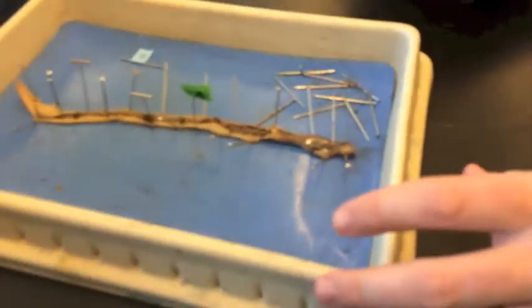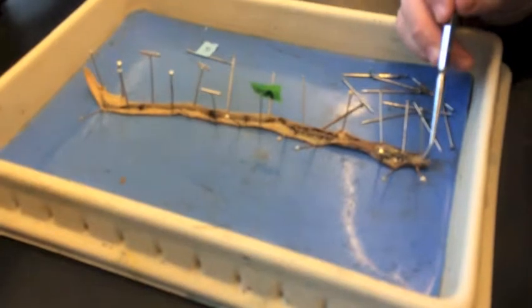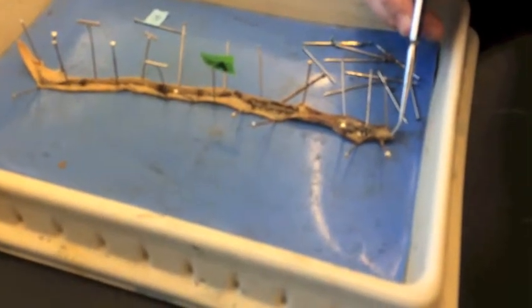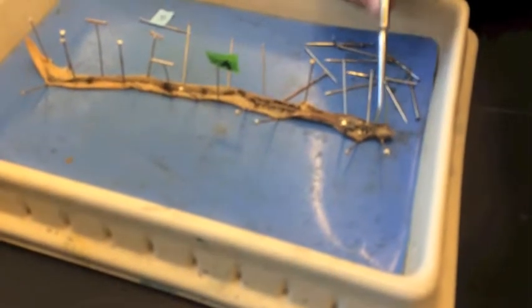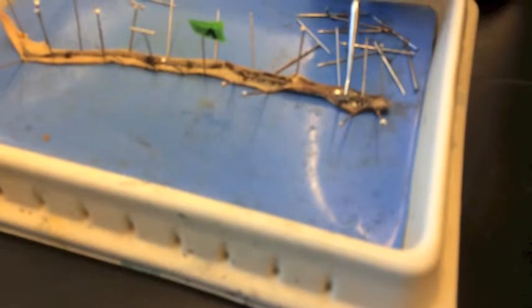Over here for your grasshopper. That's not a grasshopper, your earthworm. Crazy. There's an earthworm. Earthworm has a brain. It's that white spot right there. Pharynx. Black things are the hearts. White things are seminal vesicles. Soft structure called a crop.